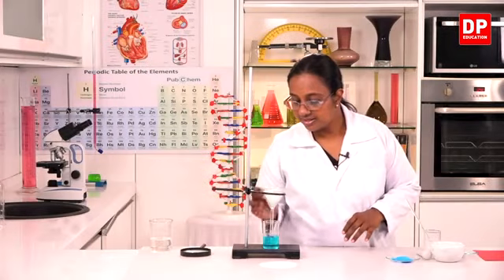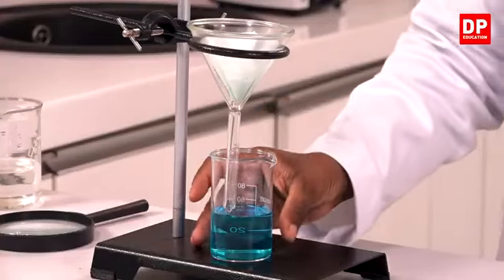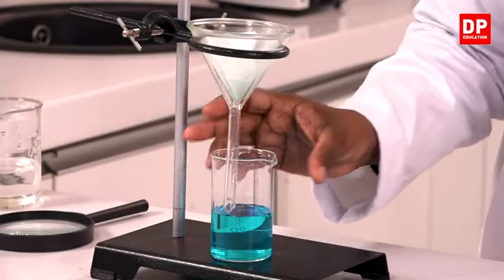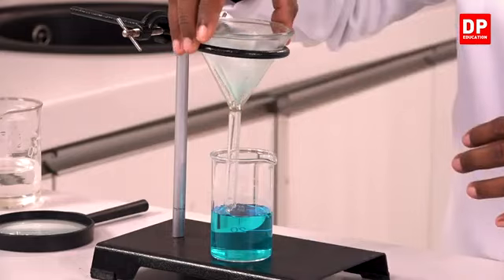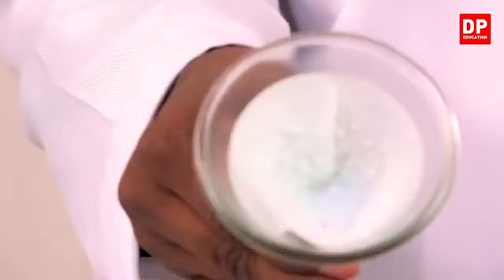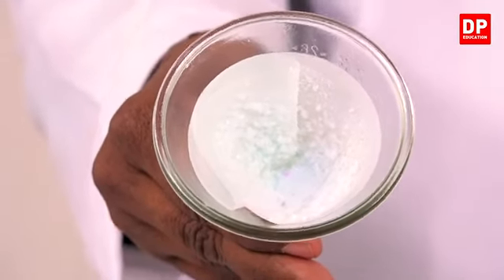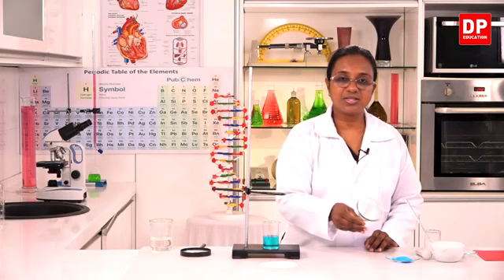So you can see now all the solution has filtered. Here you can see the clear solution. It's a blue color solution. And inside the funnel I have solid substances left. So this is something that you can observe here.